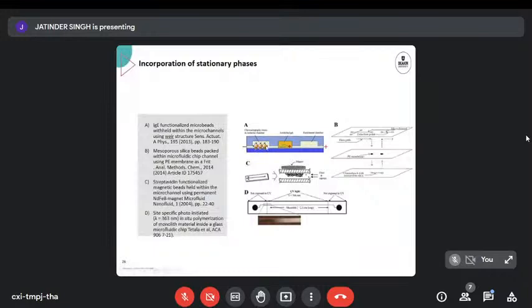Our proteins will be retained for different amounts of time depending on their affinity to this column before they're released into the gel and then end up in an enrichment chamber for further processing and or release to a mass spectrometer.